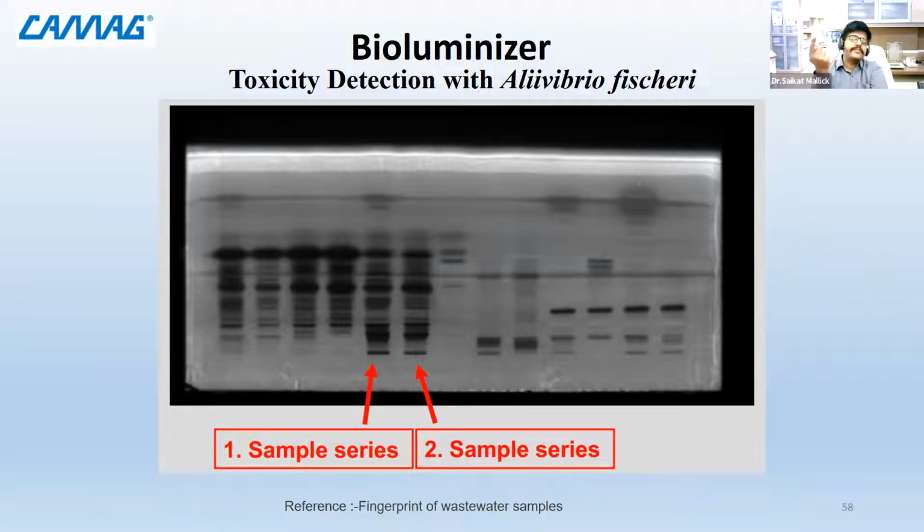Now using bioactivity in determining conclusions is a very interesting aspect, and that is where the whole concept of bioautography has developed. You use biological detection methodologies to detect components. Now they may not be directly your bacteria, but they can be derivatives like enzymes or certain proteins from the bacteria, which can be reacted with the plate and it can be seen. I have very good slides on this. As we proceed, we'll see that. That is the concept of bioautography.